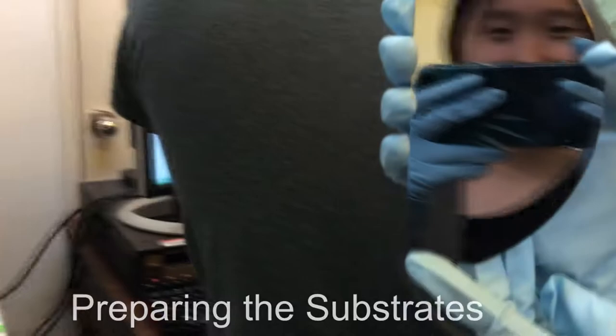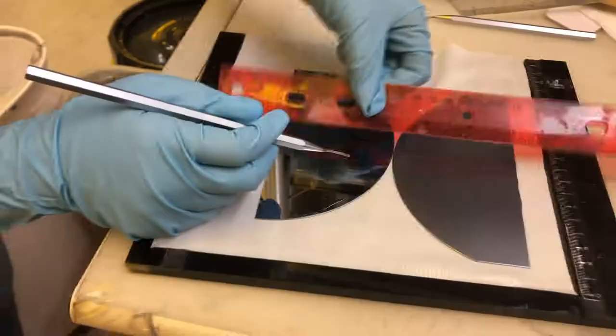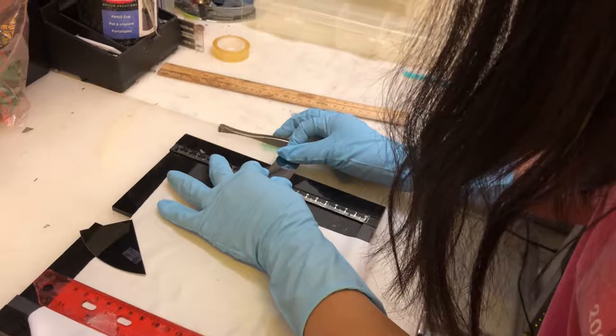We began preparing samples during the first week, which included cutting the substrates with a diamond tip cutter and then snapping it on the edge of the board to make 2.5 centimeter squares.